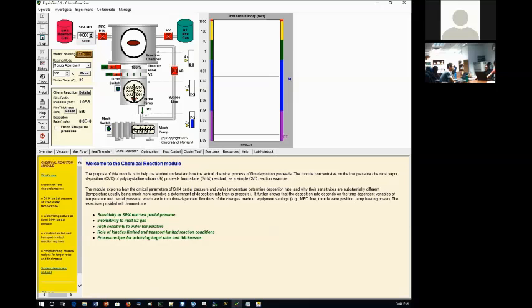But at some point, of course, you will close this high vac valve here and then you will be ready to vent the chamber to take your sample. Those professional facilities are left like this while the turbo is still working, okay? A lot of the time, they don't turn off the turbo. You guys don't have a chance to play with the turbo because they're rich and they can just replace their turbo pumps every 2 years or so. So they don't turn off their turbos. It eats away the lifetime of the turbo pump.